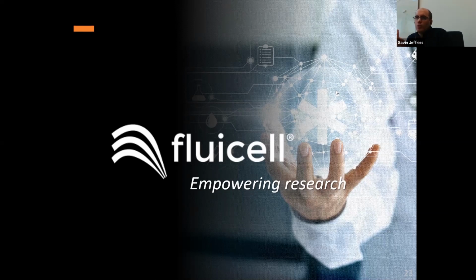If we wanted to place sensors in the cells, we could use direct sensors inside. But for the most part, our microtissues will resemble very closely how it would be in culture. Being just a few cell layers thick in 3 dimensions, as long as it's not very thick, I think it would be handled exactly the same way that you would handle it in a cell culture.